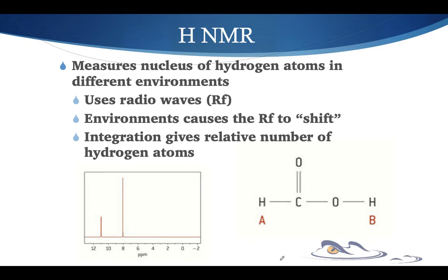And sometimes, and we'll see this a little bit later on, the computers that do this for us and collect this data for us, they integrate these curves because these curves have a lot of different vibrations.